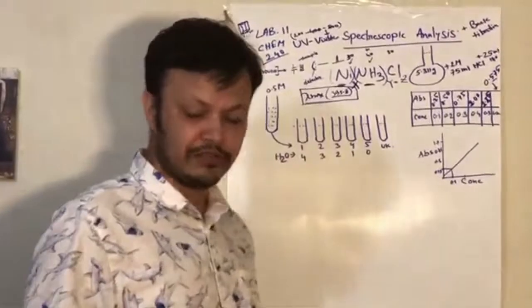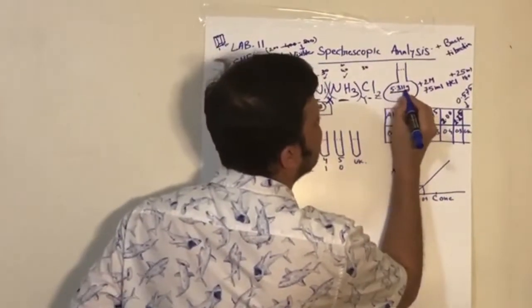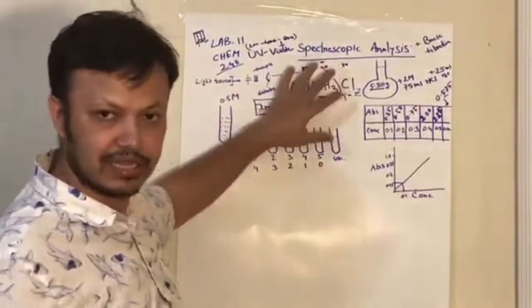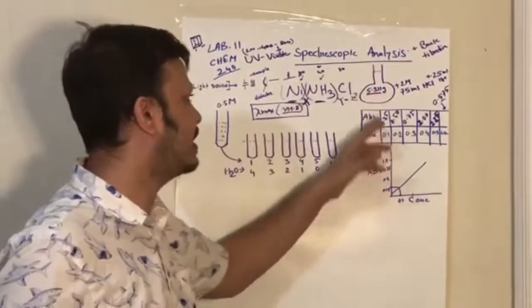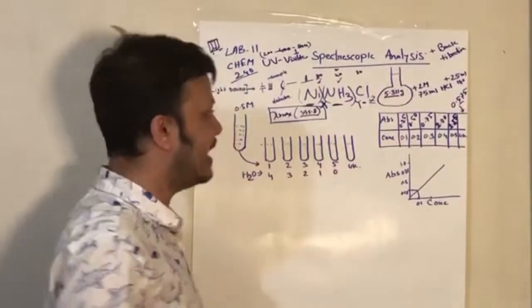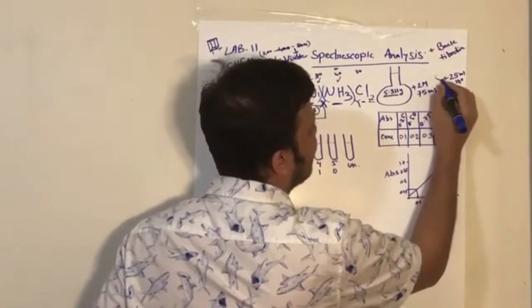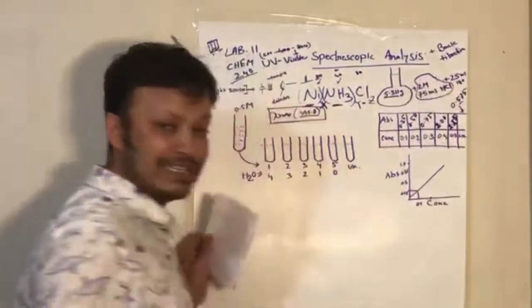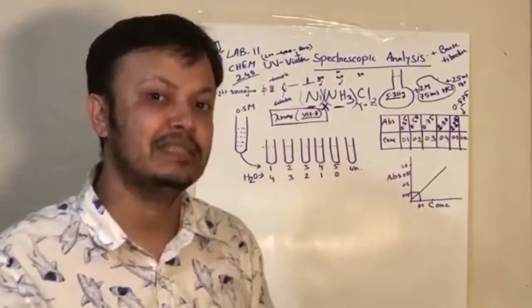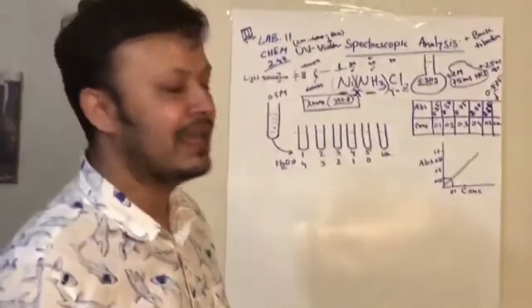To do that, what do you need to do? First of all, you need to dissolve things. You have to take 5.311 gram of the nickel ammonium chloride salt. Once you take it, you are going to add 75 ml of 2 molar HCl. We know that is excess. Whatever the excess, you will find out later on.